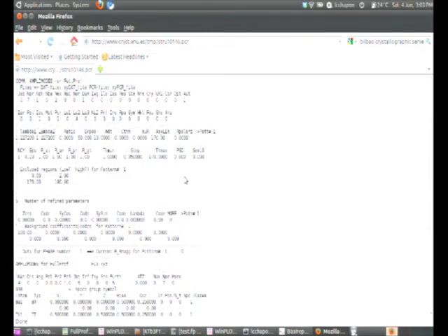First I want to make a little comment that in this green version of the plotter, you can make peak fitting, but if you open not the PRF file, but that file, then it activates it. But that's a technical thing.